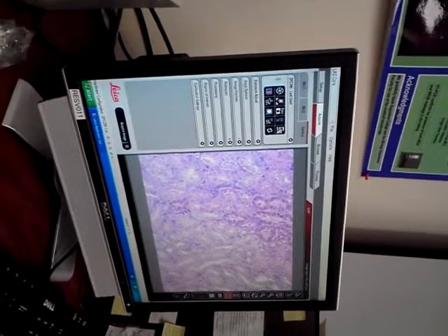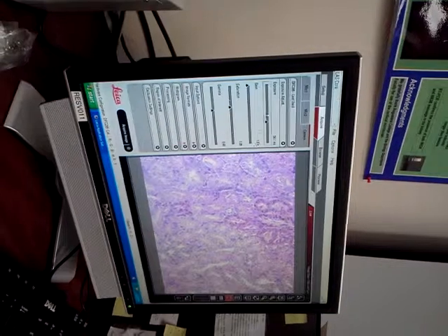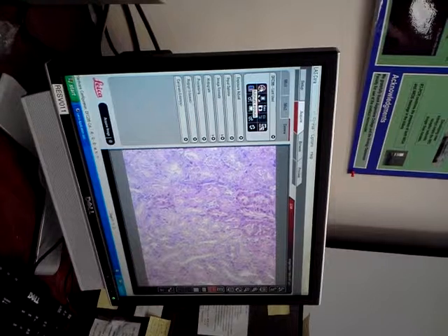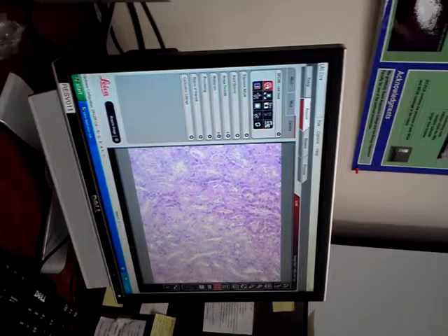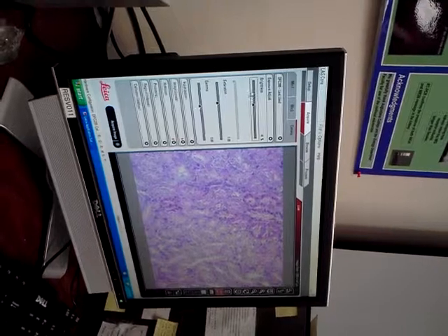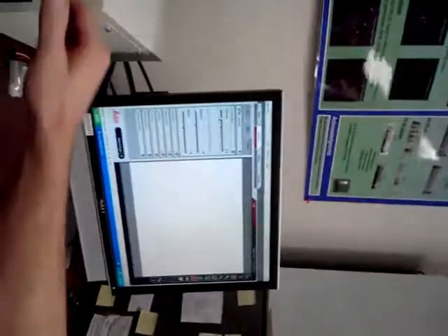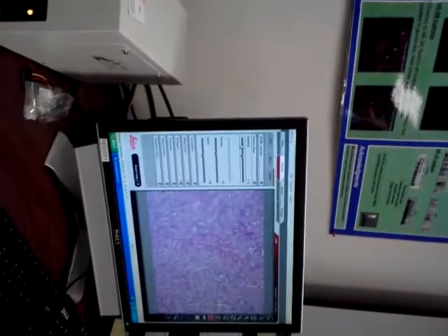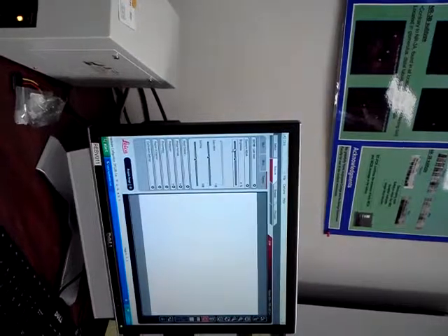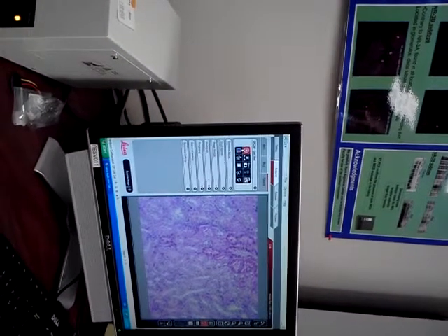That's fun. This first one is nice in the fact that you can have an automatic exposure, and what that does, if you do automatic exposure in bright field, it works really well. It takes away that exposure and just gives you brightness control. So as I go from my 20 to my 10, it's going to automatically change, rather than having to do it manually every time. Okay, so that's nice to have.